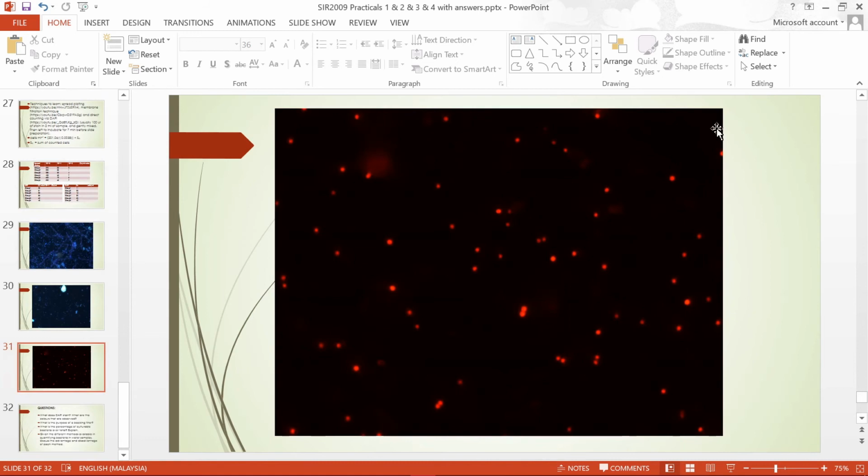Sometimes inside the same sample, if you change the filter set of the epifluorescence microscope, you can look for other colors. So here we can see the autofluorescence of the picocyanobacteria. These are most probably Synechococcus. You can see cells here.